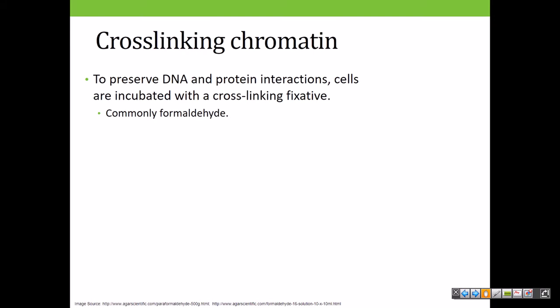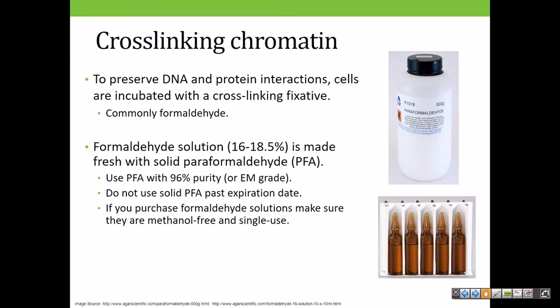Commonly, this is formaldehyde. Okay, so formaldehyde solutions are almost exclusively in this context made fresh. If you make them, commonly you will use paraformaldehyde, which is a polymerized form of formaldehyde. You're going to dissolve it in water and a few other things, or in PBS, and then use it immediately. You don't store it because it can oxidize with the air. It doesn't have a long shelf life. Because of that, you don't want it to oxidize. It'll form formic acid, ruining the pH, affecting your fixation, so you have to make it fresh.